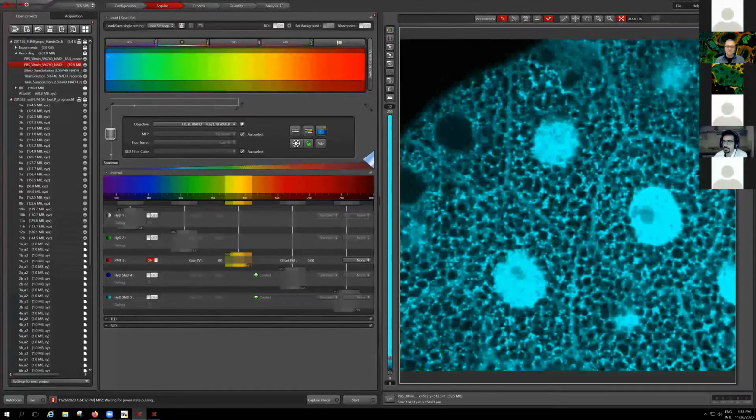Okay, do we get the other questions? Paddy Day is asking, when you speak about controls, do you mean the usual negative and positive experimental control, or do we need extra control related to the FLIM experiment? So, Connie, would you want to take it? Go ahead with the answer to that. Connie? Can you hear me? Sorry, I unmuted myself.